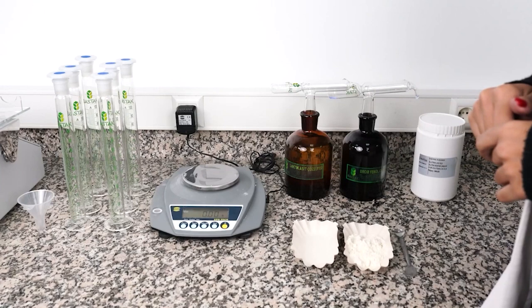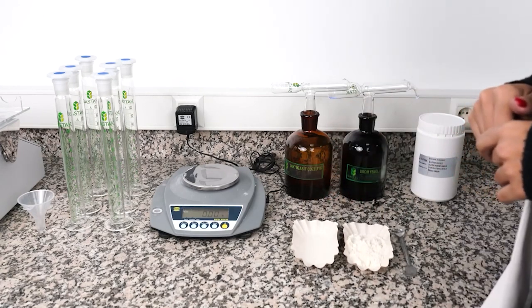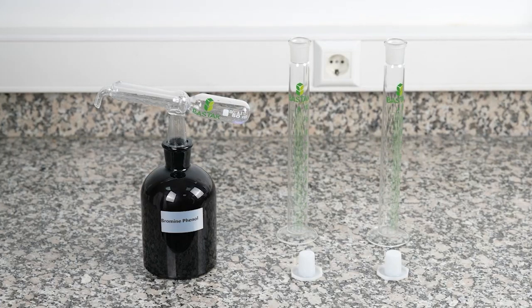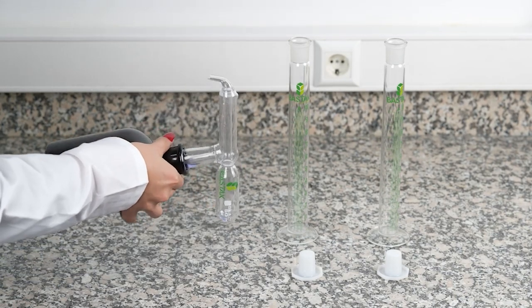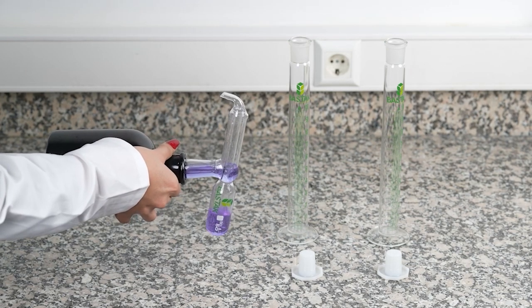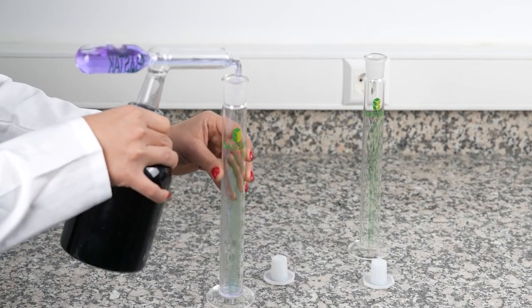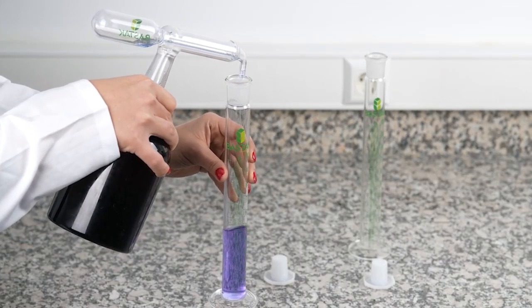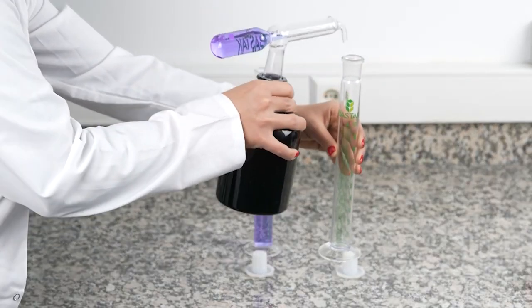The Bastak brand 3100 model sedimentation device uses bromophenol blue solution and lactic acid solution for sedimentation analysis. Sediment tubes for the analysis are placed on the table. Using an automatic pipette, 50 milliliters of bromophenol blue solution are drawn and transferred to the sediment tubes. The same process is repeated for the other sediment tube.